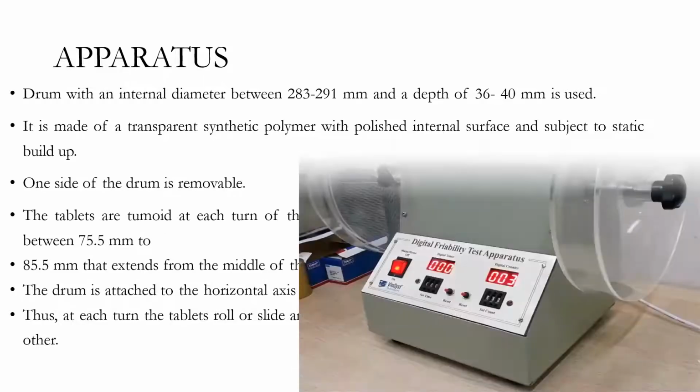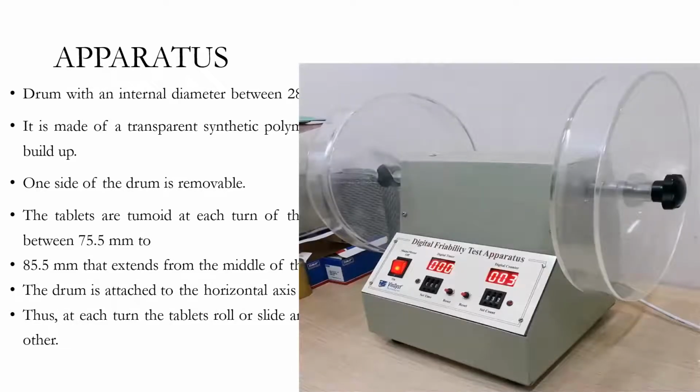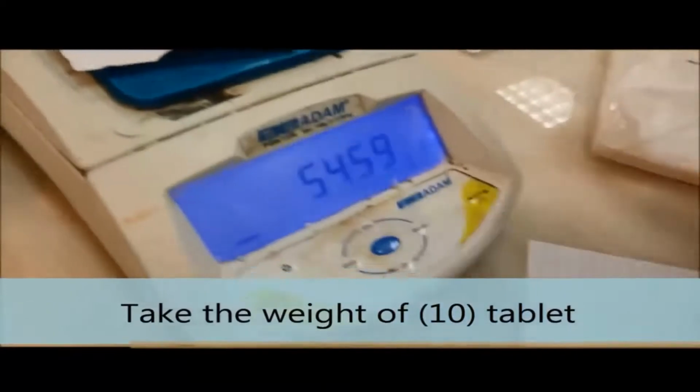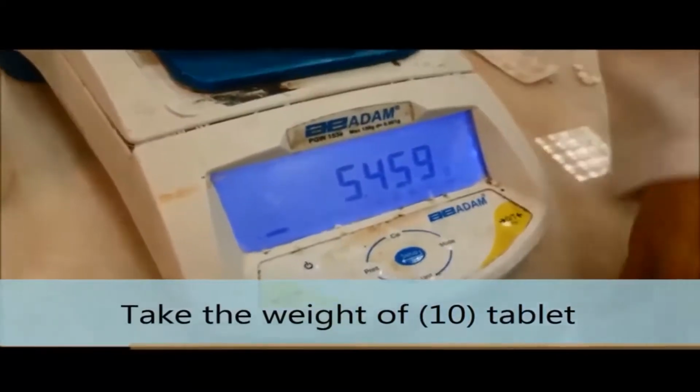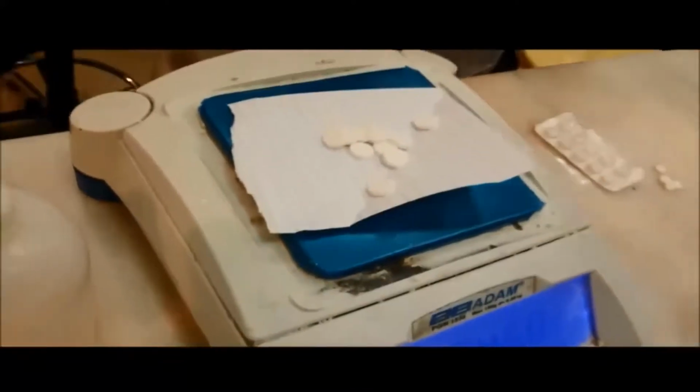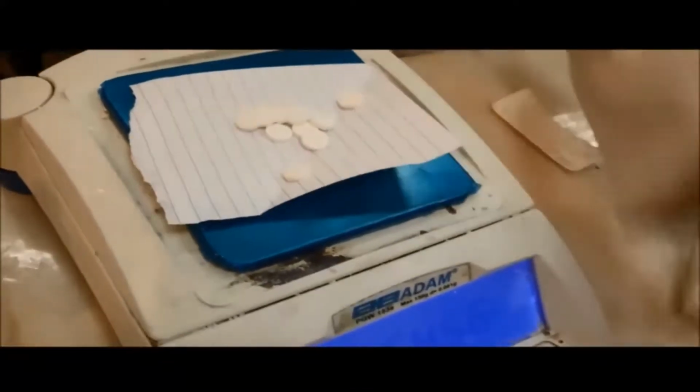Here you can see this is the test apparatus, the digital friabilator test apparatus. Here we can check in digital form, as a digital panel is there. So how this test should be carried out: we have to take the tablets and weigh the initial weight.